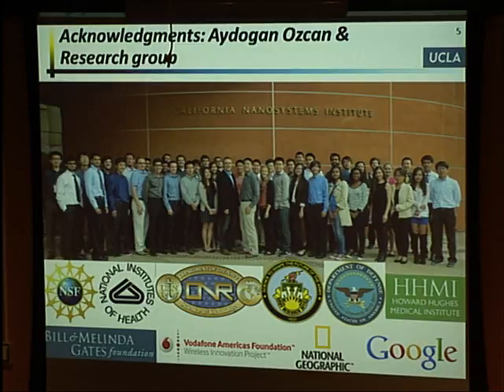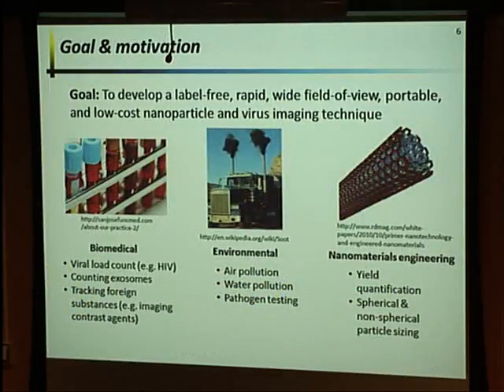But then, of course, I'd also like to acknowledge all the other postdocs and graduate students who are also working in this group and helping this effort. So again, the main goal of what I'm going to talk about today is to develop a label-free, rapid, wide field of view, portable, and low-cost nanoparticle and virus imaging technique.